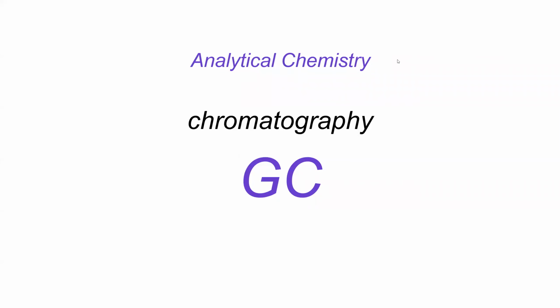Hello and welcome to this lecture on gas chromatography in our series on chromatography. We'll be covering the introduction to gas chromatography. We'll also be talking about some of the methods used in gas chromatography. And we'll be continuing on to look at detectors and method development.